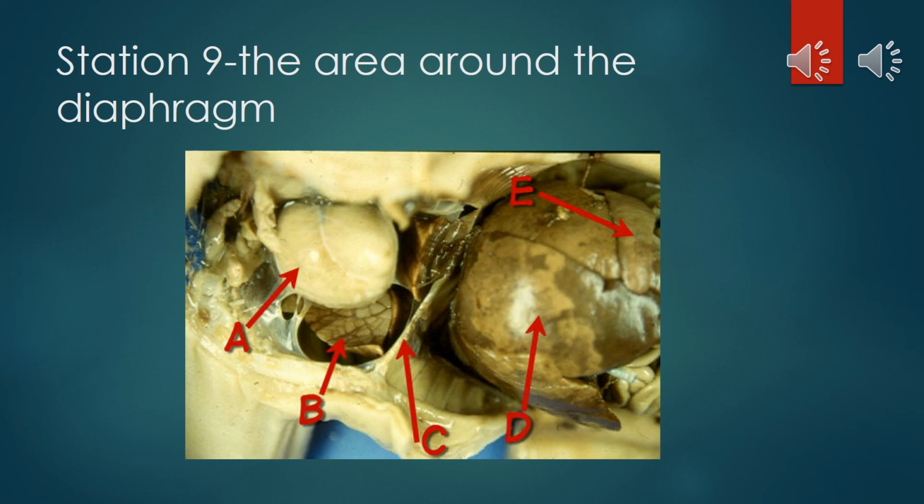Okay, so please don't forget to label yours, and then have other people copy yours as they're identifying the parts on the pig so they know what they're looking at. Also, make sure you pause this throughout if you can, and rewatch it so they can actually know what to label also.